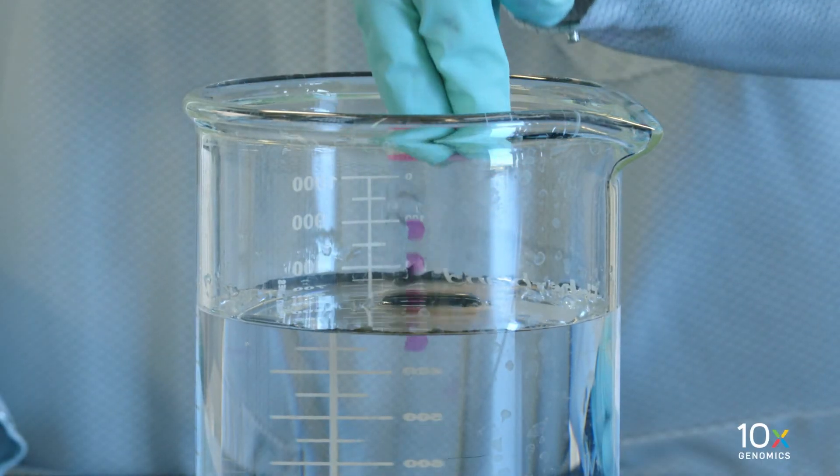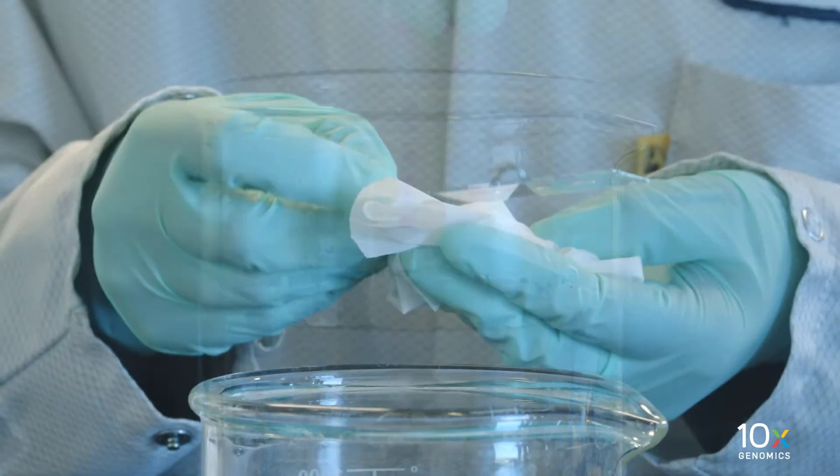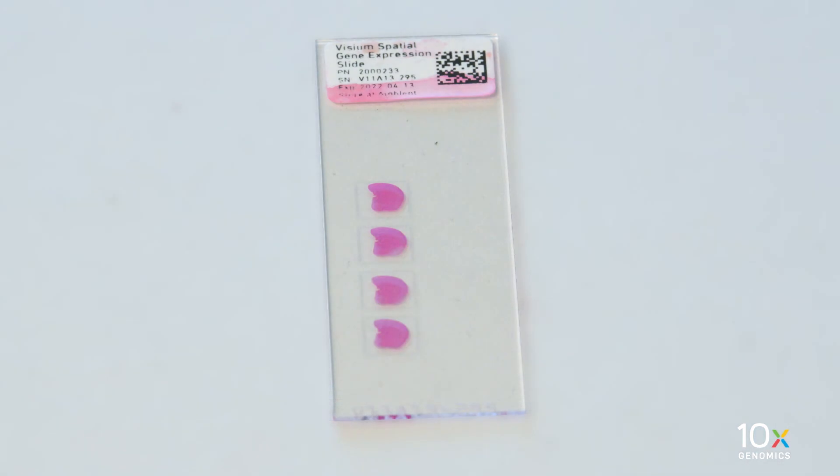Gently immerse the slide 15 times in the water to ensure that all glycerol is removed. Wipe the back of the slide with a laboratory wipe. Place the slide on a flat, clean, non-absorbent work surface and air dry.